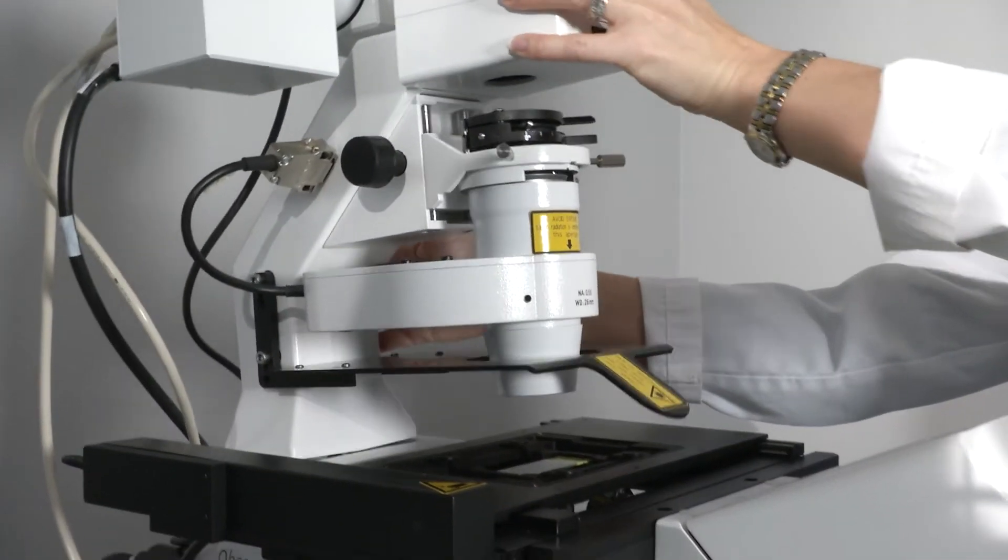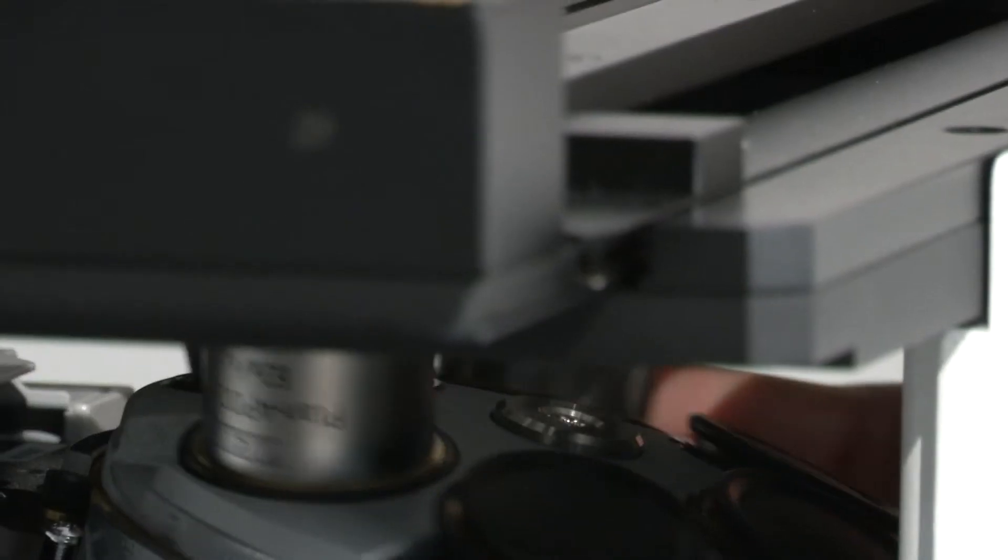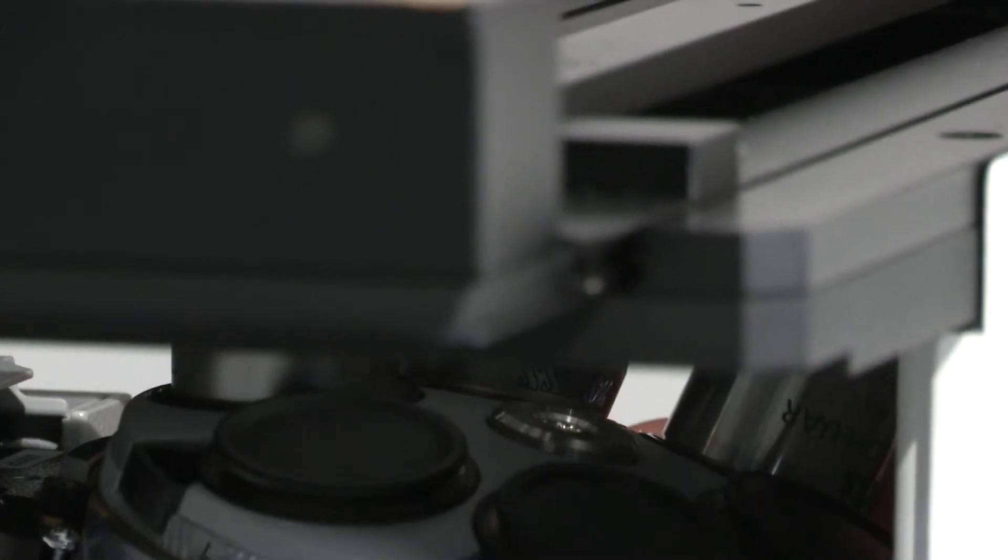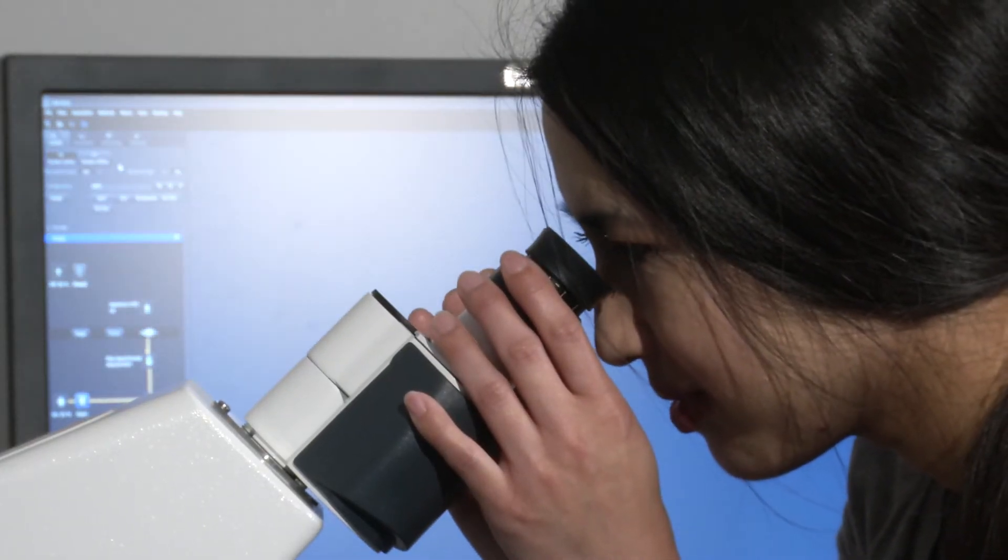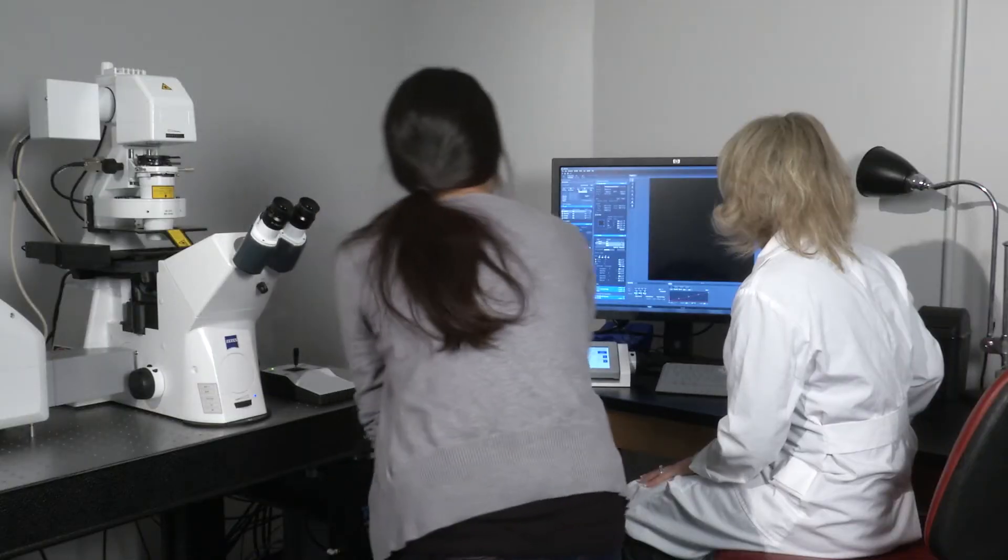This is the laser scanning confocal microscope here in the Fletcher Jones Microscopy Center. The instruments housed in this facility are used primarily for research as well as for teaching.